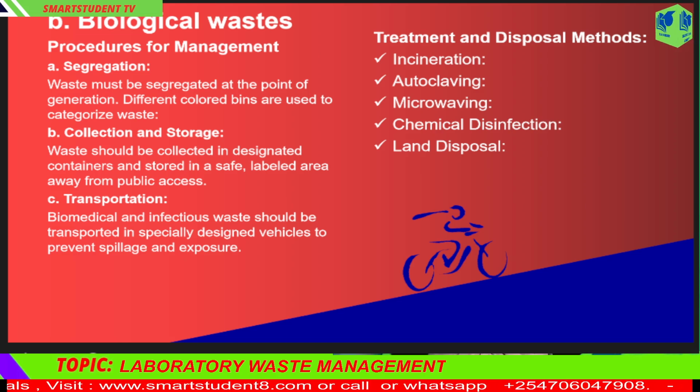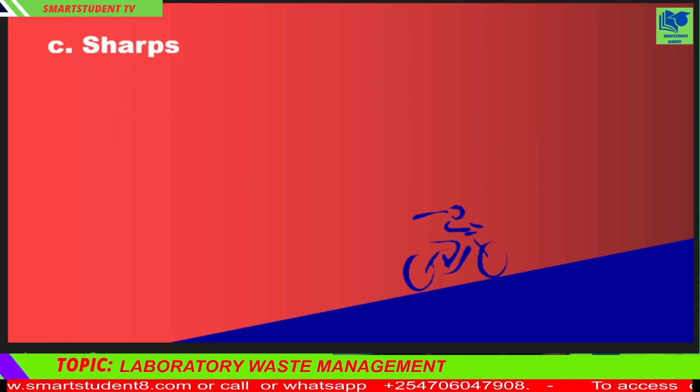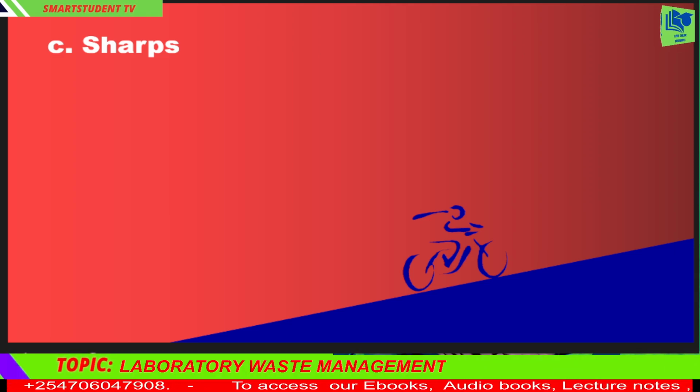6. Regulatory framework and guidelines. Many countries have established regulations for biomedical and infectious waste management. For instance: 1. WHO Guidelines on Biomedical and Infectious Waste Management. 2. Biomedical Waste Management Rules, e.g., India, 2016. 3. OSHA Standards, USA.